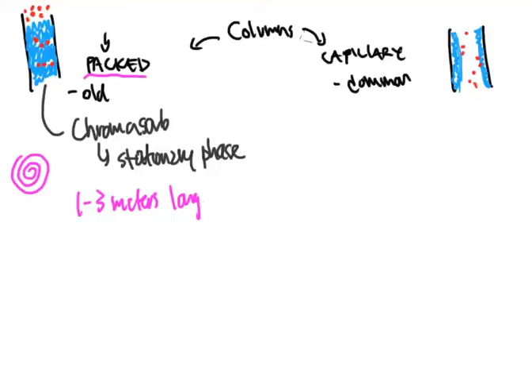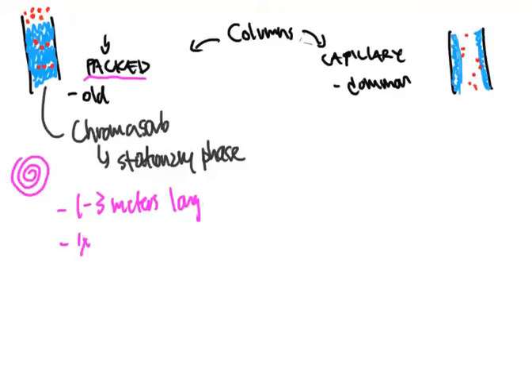That will stretch out to be about 1 to 3 meters. The things are very wide as well. Packed columns traditionally have anywhere between a fourth to an eighth of an inch in width. 1/4 to 1/8. Well, that's why they can take a lot of sample.